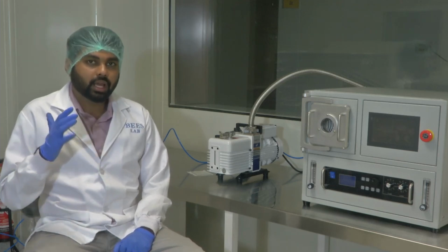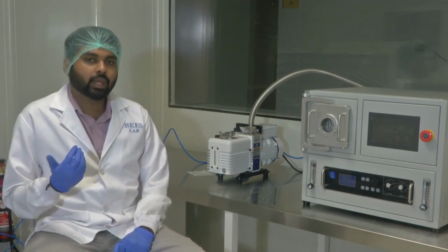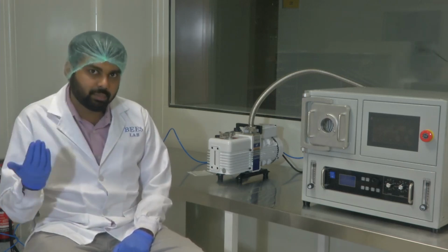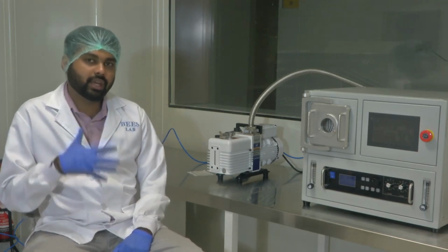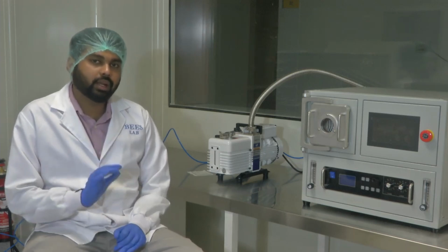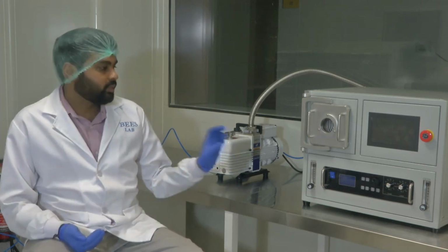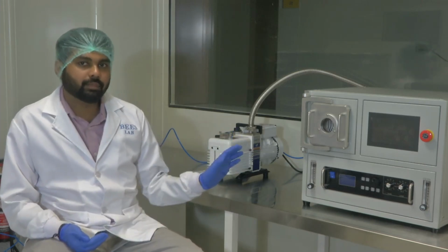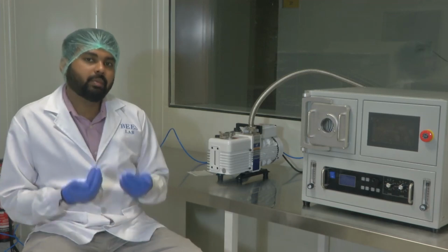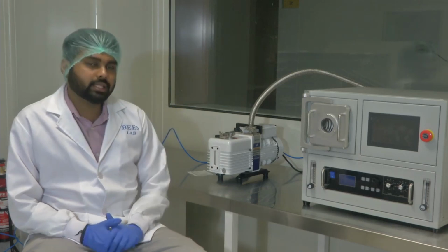So there is a reflection that happens. This reflected power goes back to the system that is supplying the power. If that reflected power is more, it creates current within the system supplying power and can cause burning of the wires and everything connected. So our design objective is to always reduce the reflected power and make sure that the forward power, the delivered power, is maximum. We will show you how we have tuned this system to deliver maximum forward power and minimum reverse power. These are the fine things that you need to take care of while you operate the system.